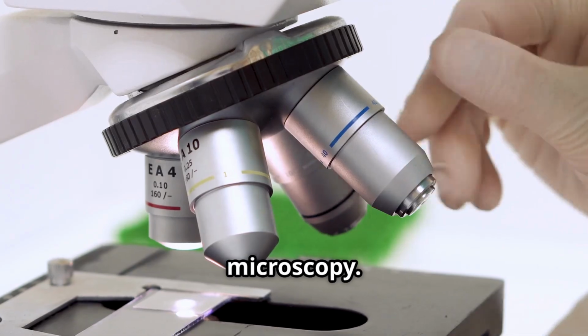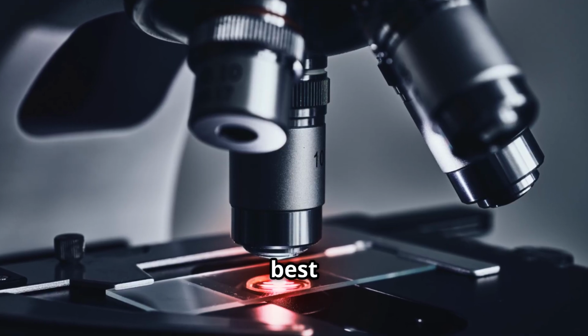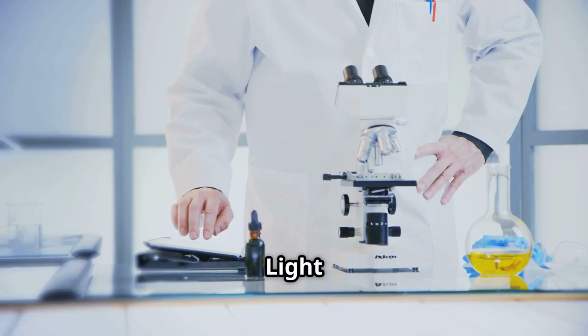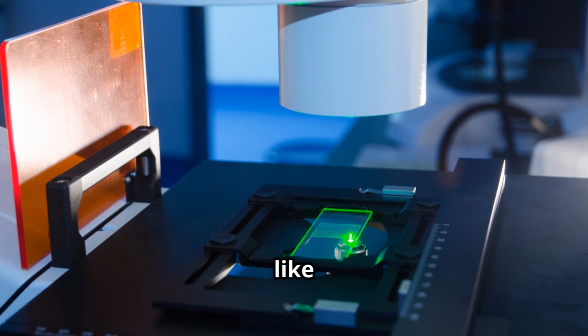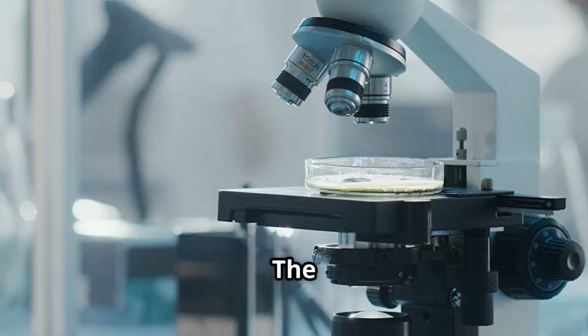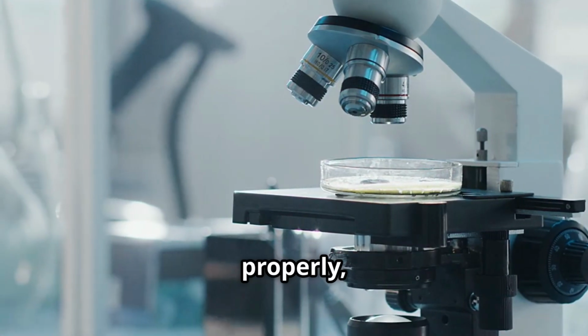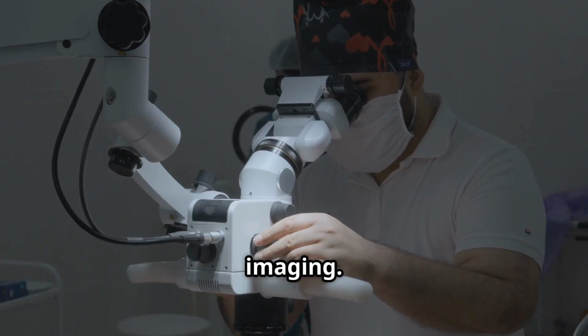Illumination is crucial in microscopy. Proper illumination ensures that you get the best possible image. Light microscopes typically use visible light, but special types, like fluorescence microscopes, use ultraviolet light. The light source needs to be directed properly, and the intensity can be adjusted for optimal imaging.